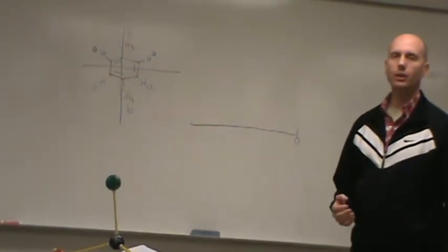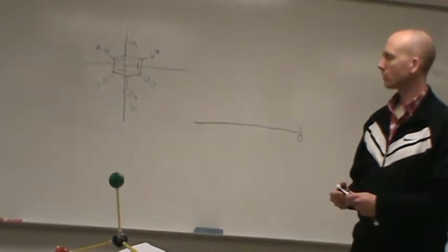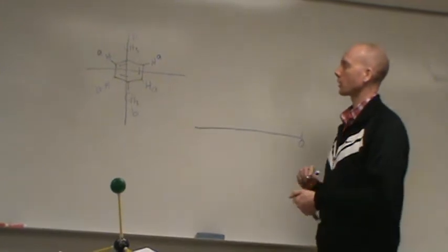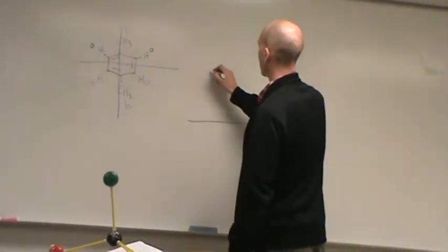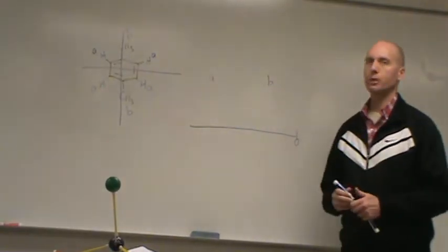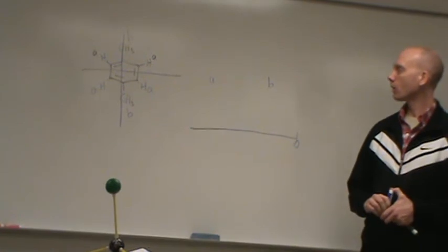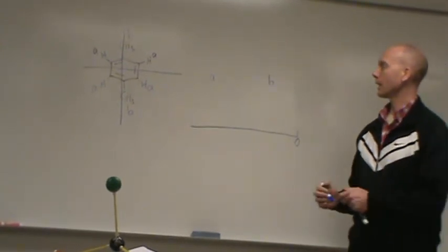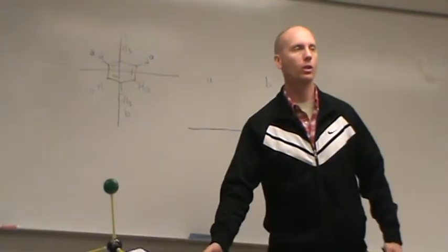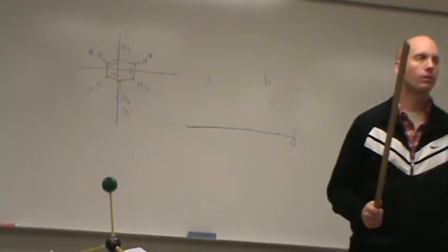Which of those 2 peaks, A or B, will be more downfield? A. The A, because it's right on the benzene. And B will be more upfield, okay, CH3s. What will the B signal look like? Well, hold on, question. So you said A would be more downfield because it's right on the benzene.